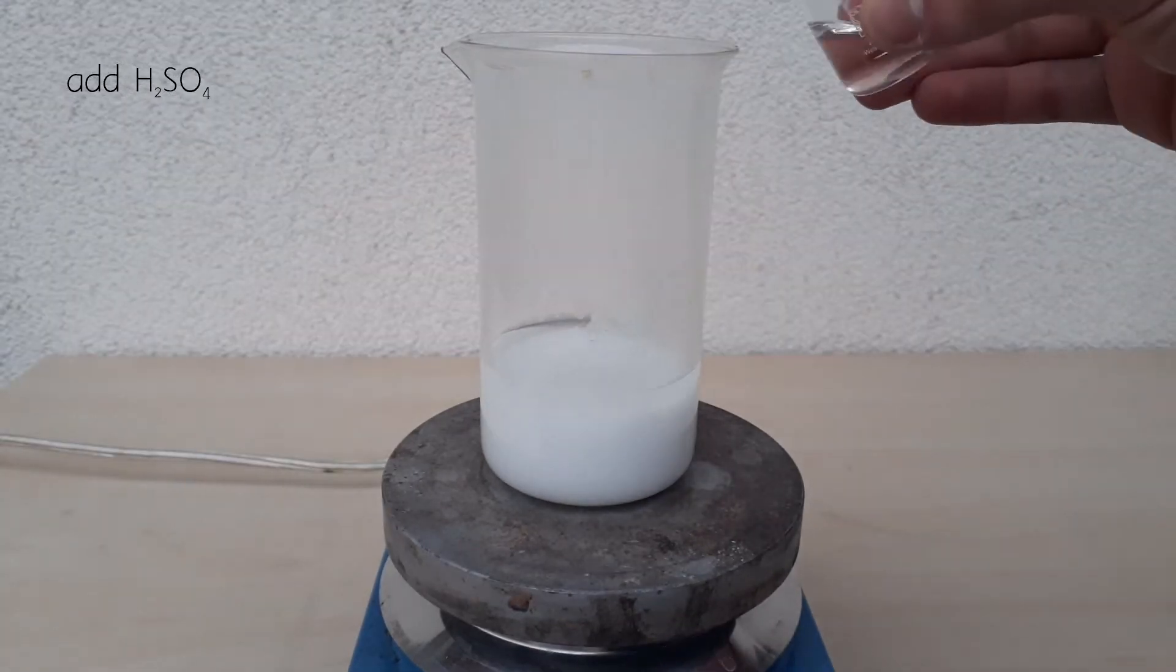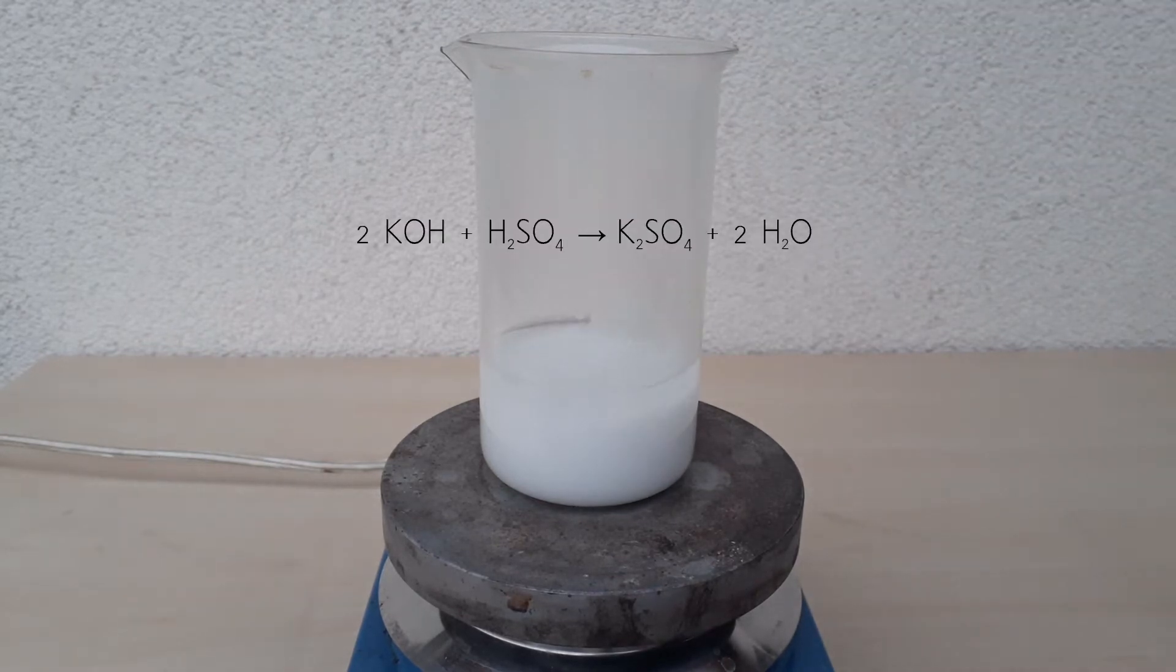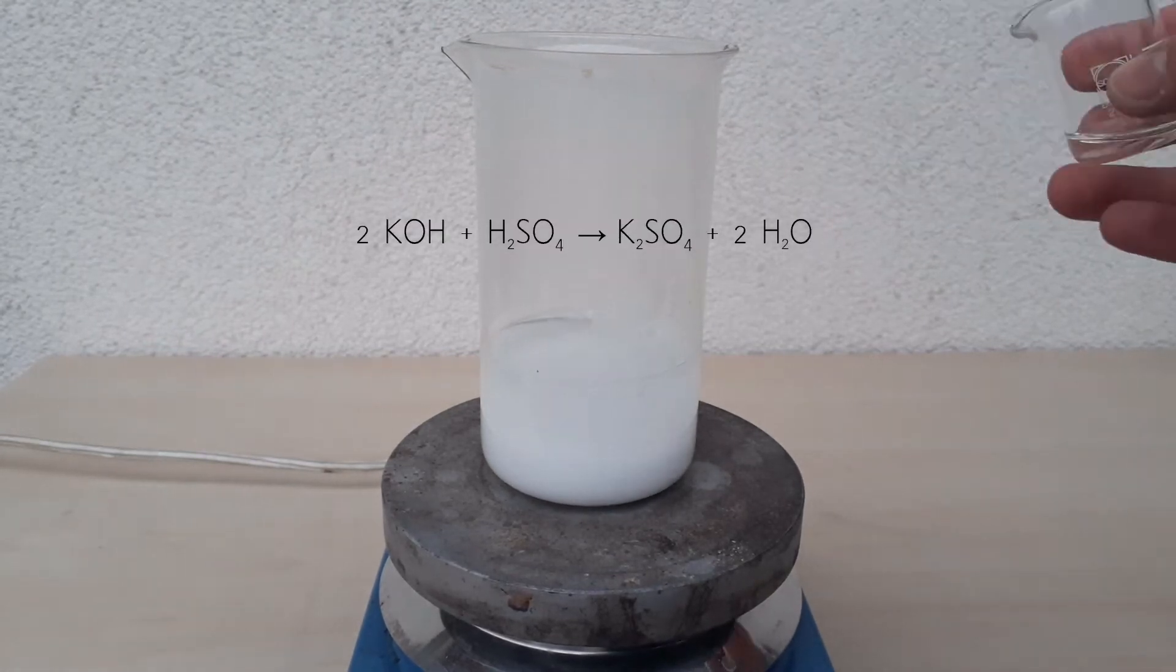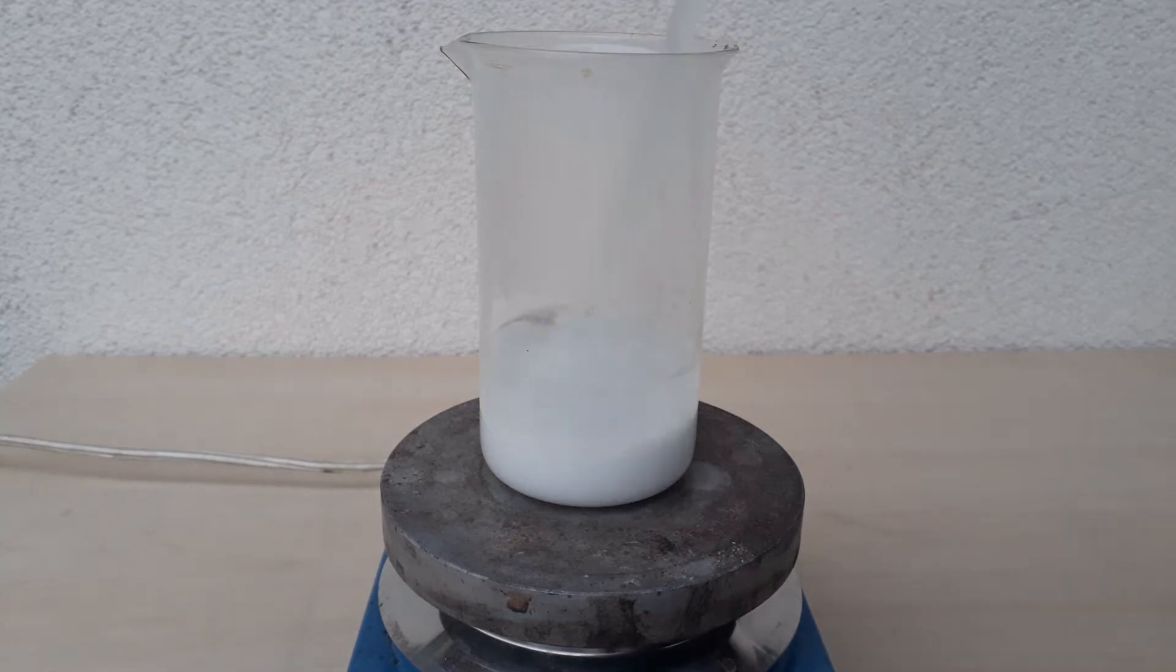Next step is to add sulfuric acid to this until the pH of the solution becomes neutral. Whilst adding you can see a lot of bubbles evolving, and this is spontaneous boiling due to the reaction being very exothermic.